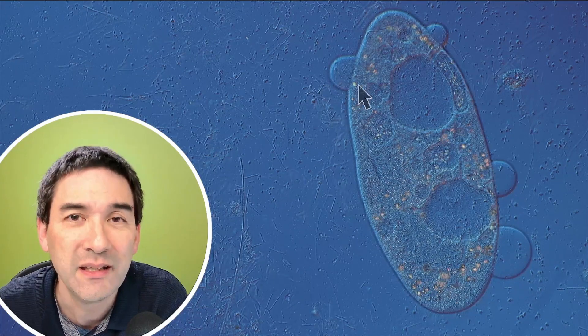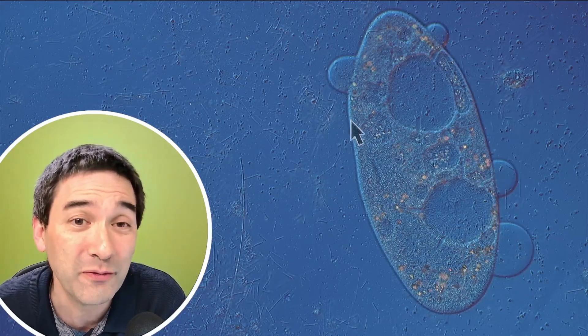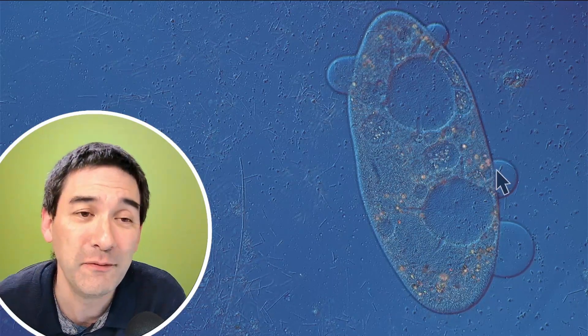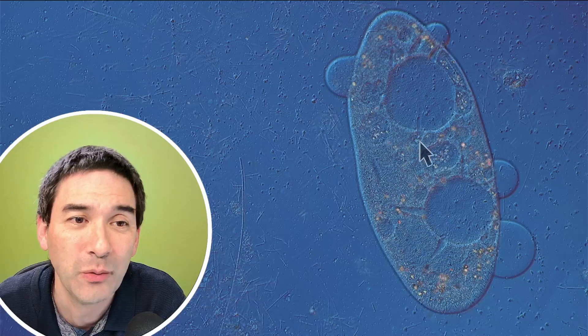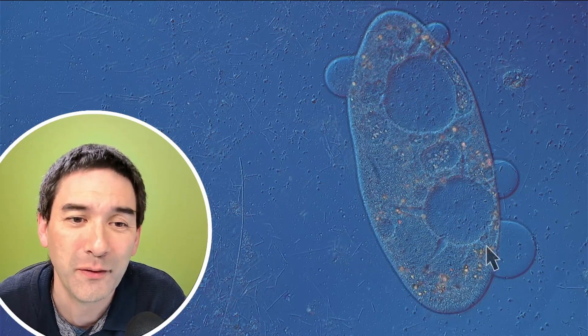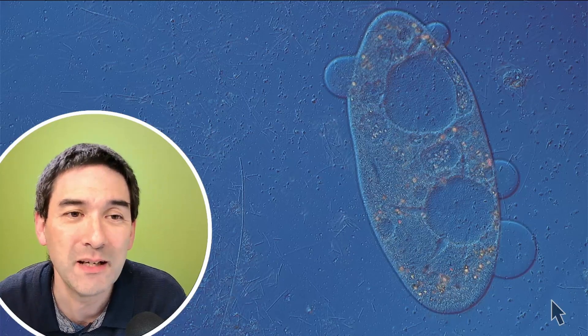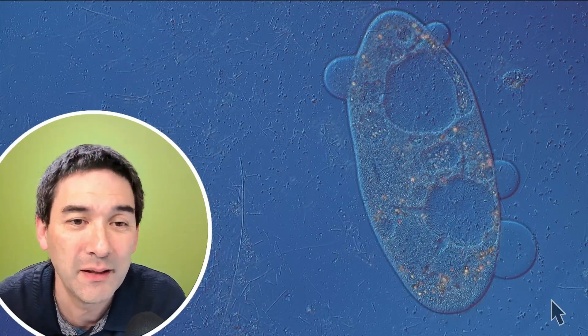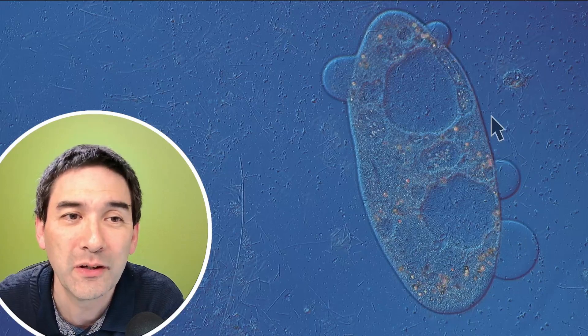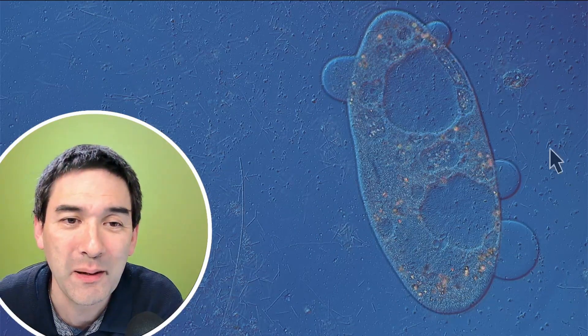This is actually a sign that the integrity of the cell is destroyed now. Those paramecia that you see over here do not have a cell wall. So this means that they're not very strong. They're quite flexible, but the outside is not very strong. This actually allows the cell to pop open if there is too much pressure. And as a matter of fact, those large circles that you see over here are indeed the two contractile vacuoles which are being pressed apart now because of the pressure of the cover glass. So this is basically what we're witnessing here—the end of a cell. And the much smaller bacteria that you see floating around here, they don't mind. They're just doing fine because they're significantly smaller and they're not inhibited in their movement by the tight space on the microscope slide.